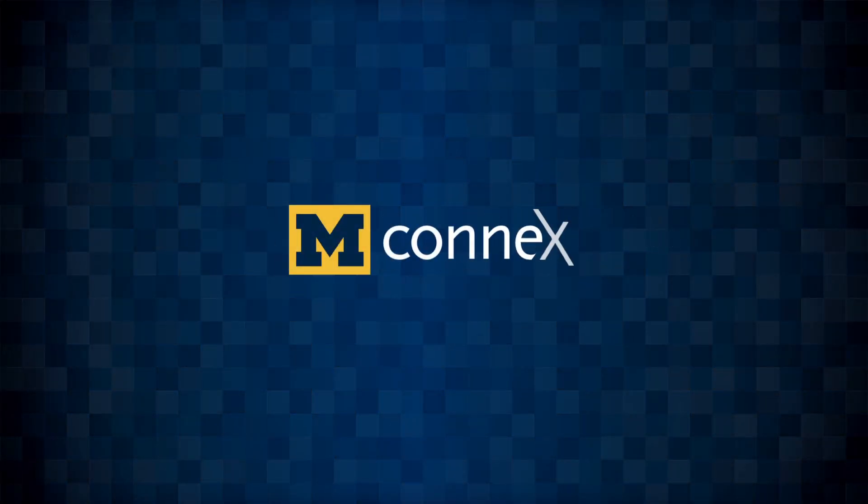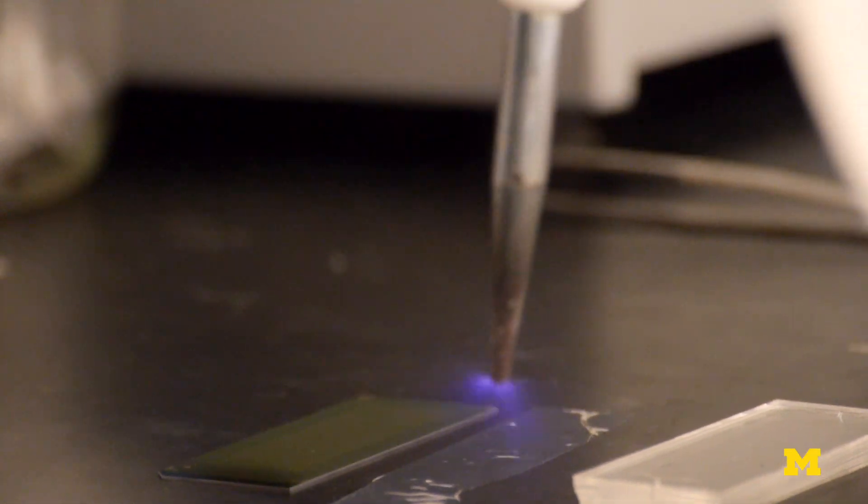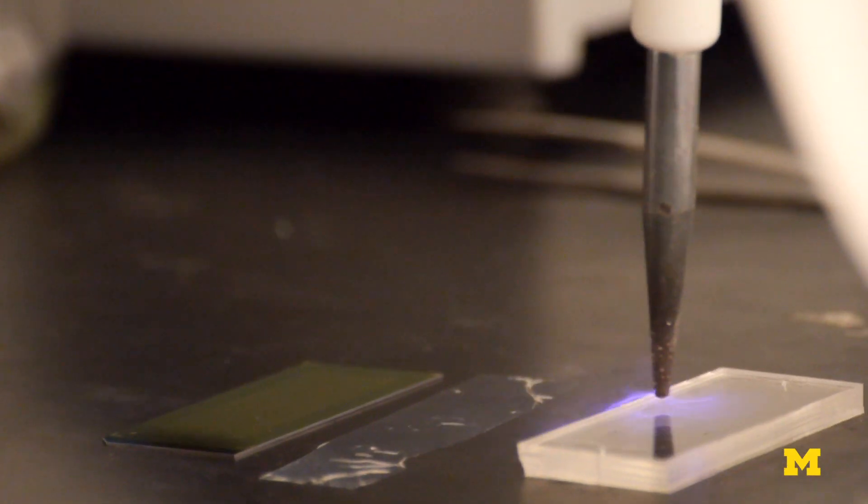Sometimes off-the-shelf technologies won't work. You have to think out of the box. So he's going to bond the graphene oxide chip with the polymer.